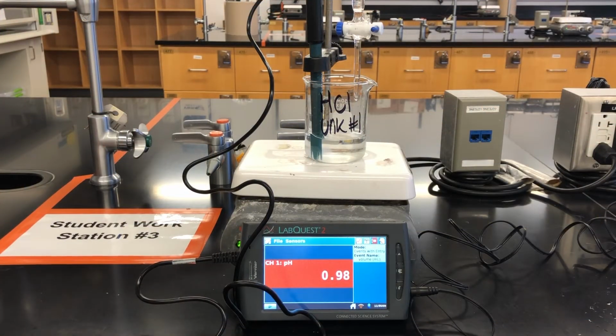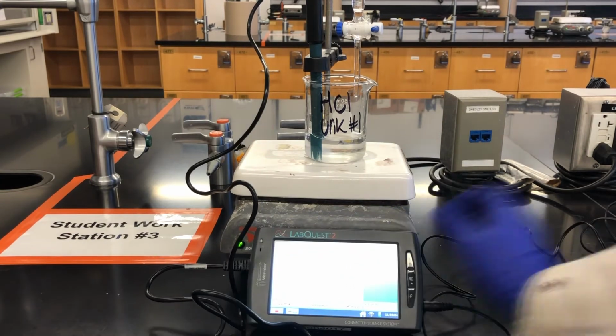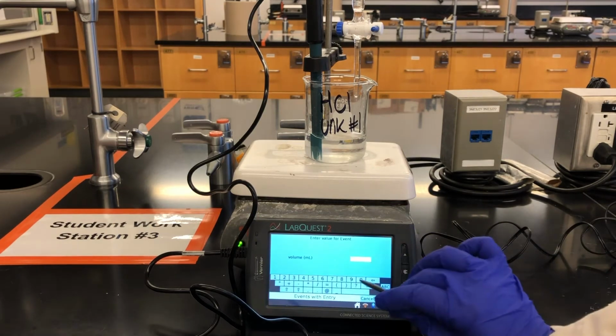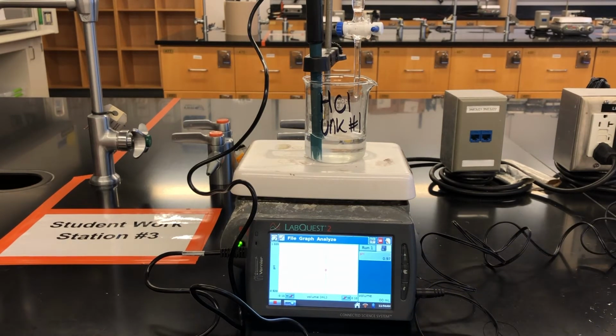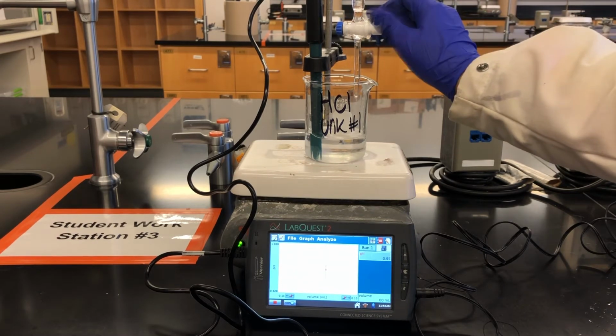To start the titration, we begin collecting data on the LabQuest, and we collect the first data point, entering 0 milliliters. Next, using the burette valve, we carefully add 2 milliliter increments of titrant until about 3 milliliters below the endpoint, while recording the burette volume and pH upon each addition.